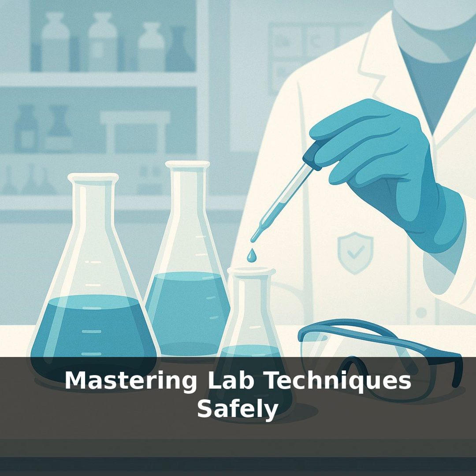There's often a silent resistance. The PPE is annoying, or I'll remember the emergency steps if something happens. But here's the key idea. The small discomfort of a lab coat or taking an extra half-minute to find the spill kit is nothing compared with the hours or days lost if an avoidable accident sends you or a colleague to occupational health.